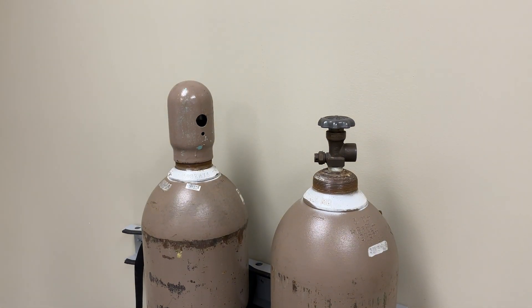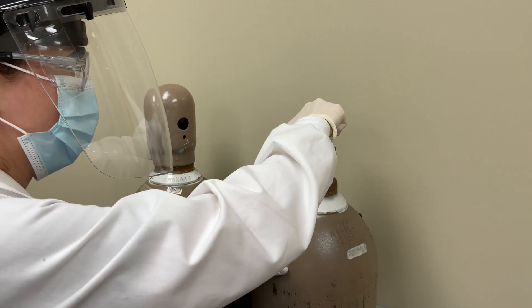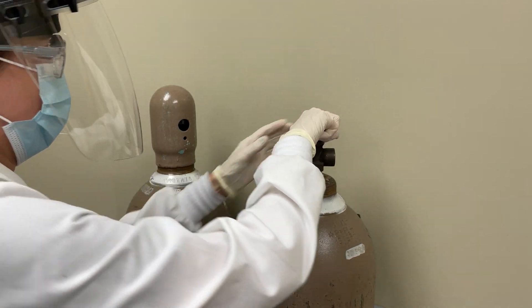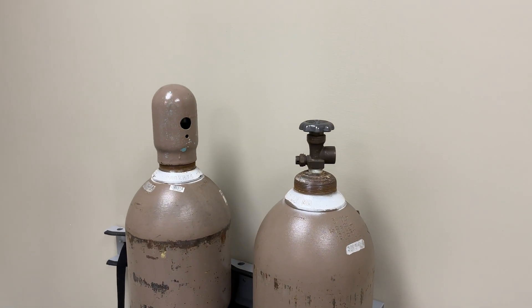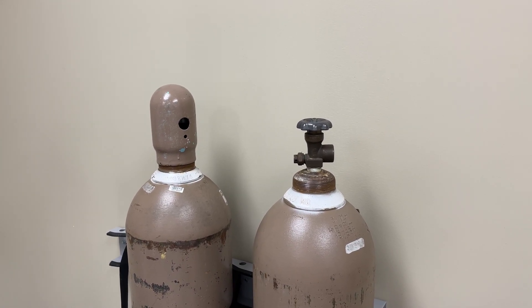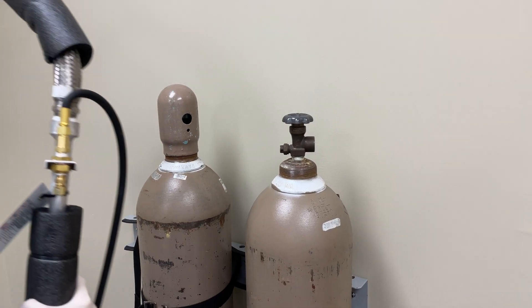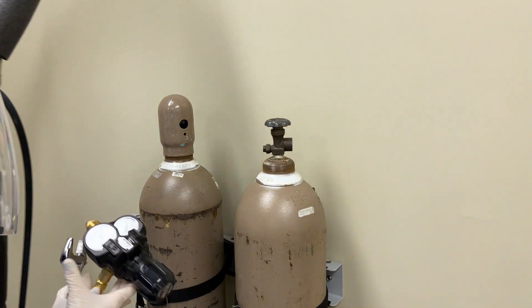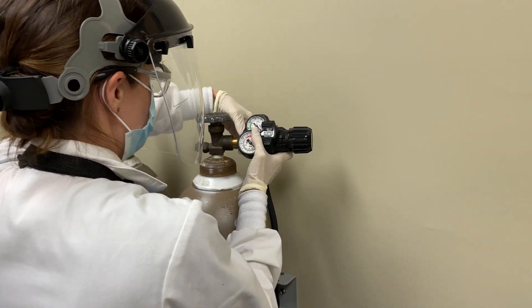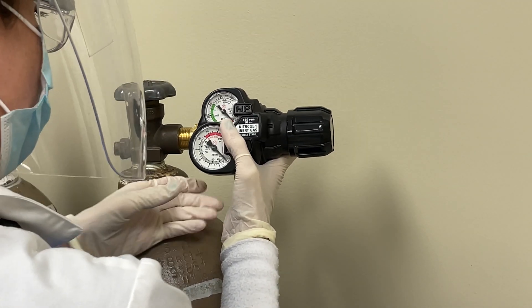Remove the cylinder cap from the tank. Momentarily crack open and close the nitrogen gas valve to dislodge any dust or dirt that may be present. Connect the two-stage pressure regulator to the gas-use valve on the nitrogen gas cylinder and tighten securely with a wrench.